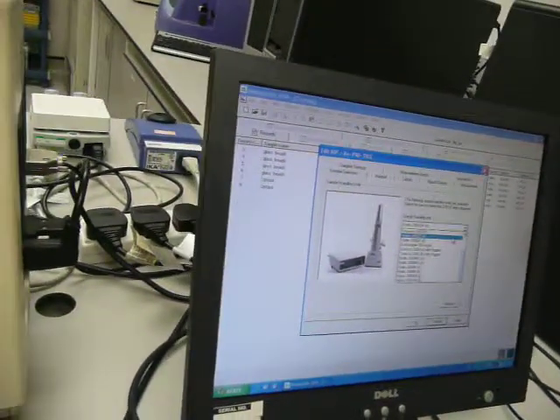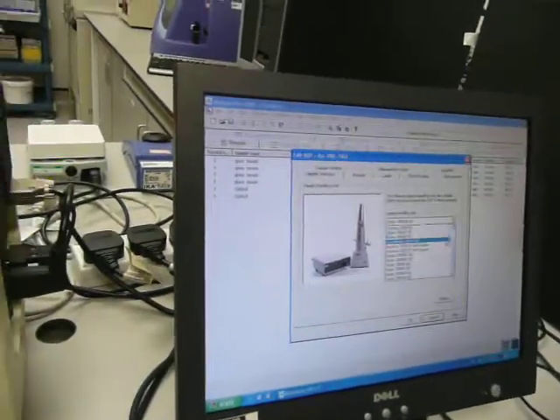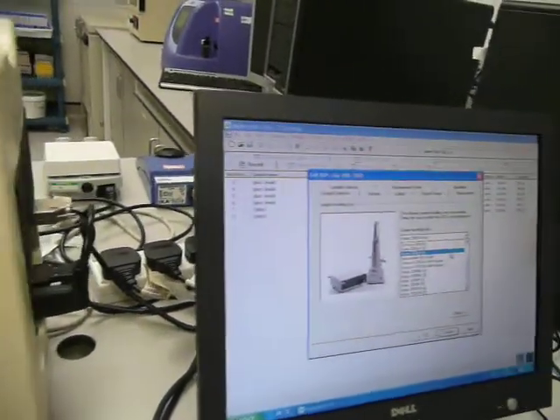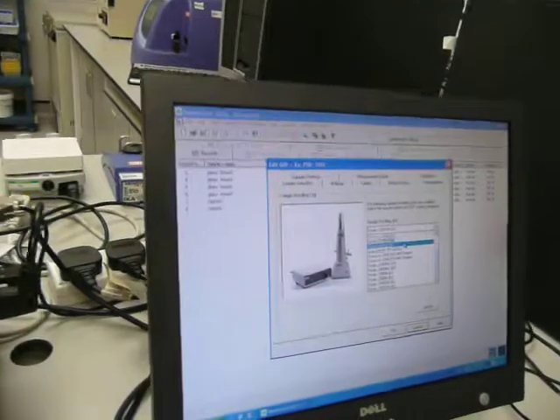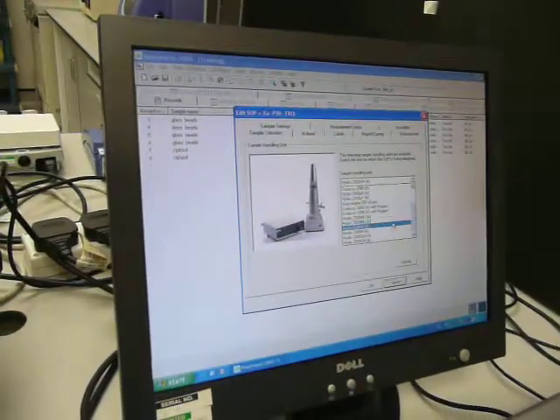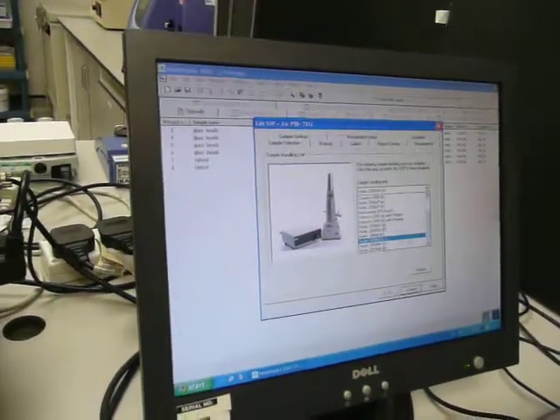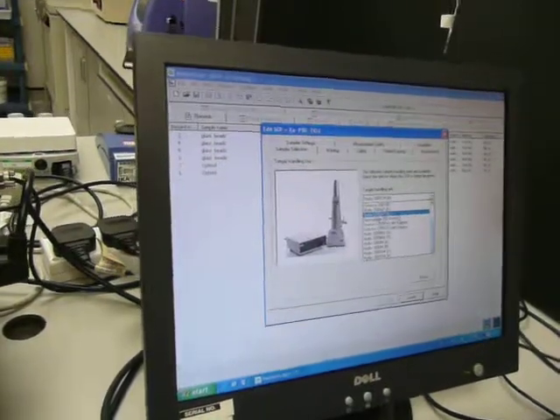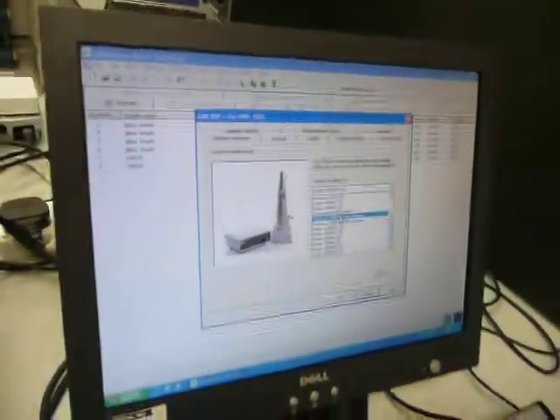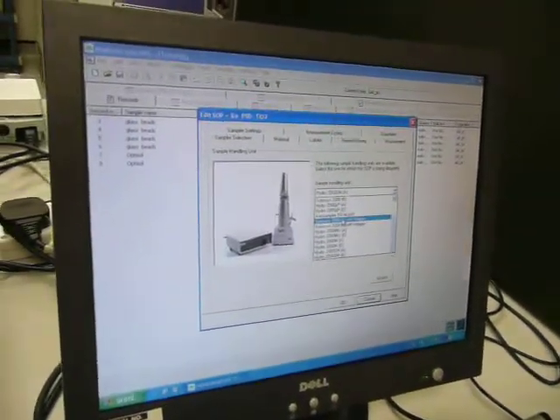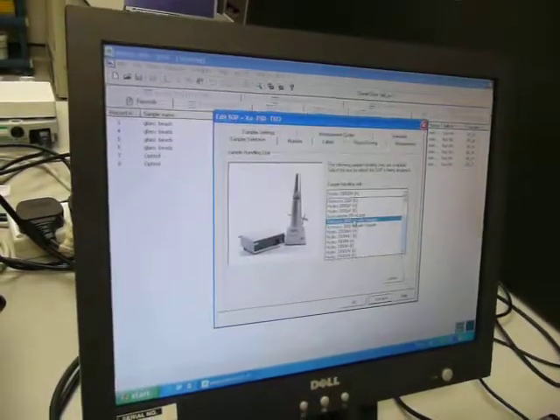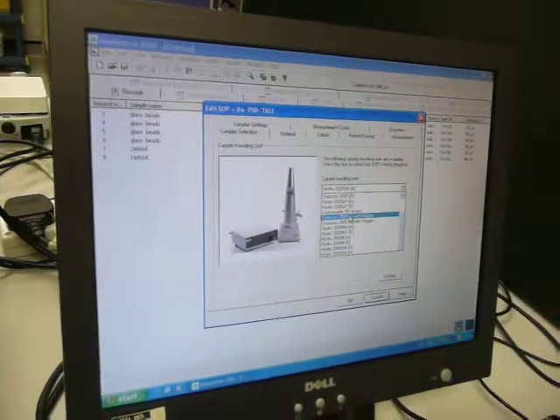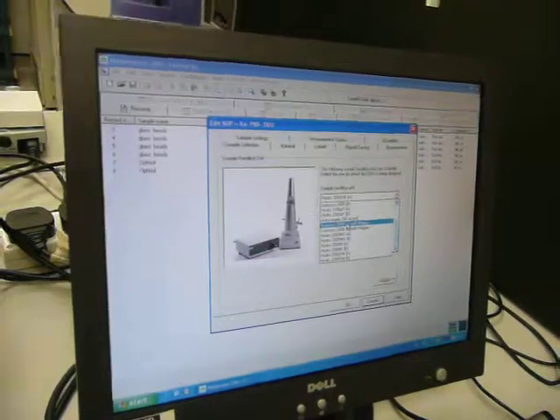And I think on this one we've got Hydro 2000MU and one round the back which is another M, I think. S, M, I think. SM, yeah.